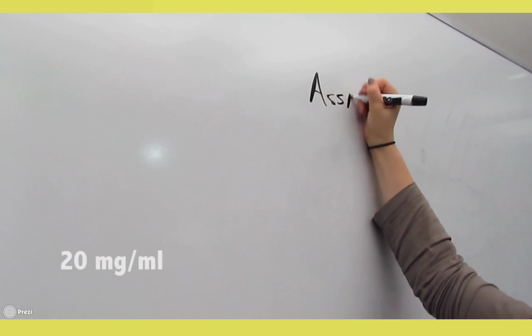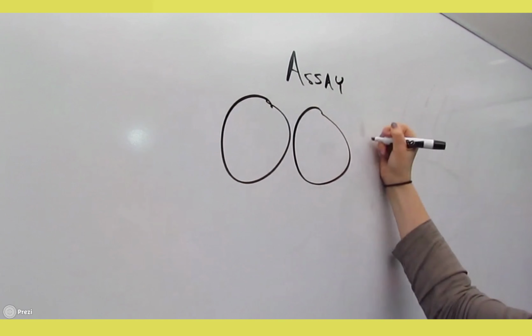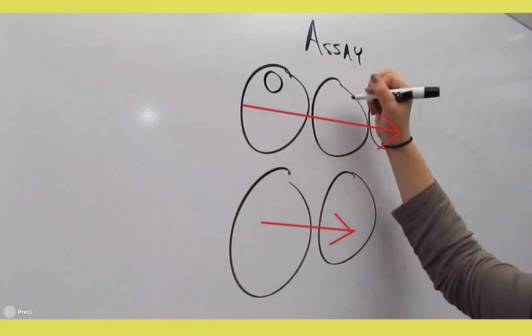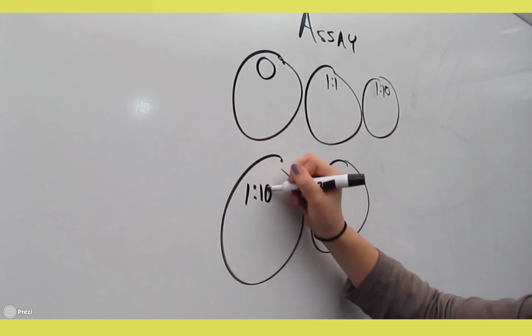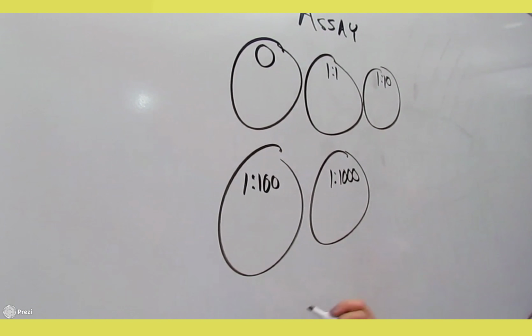As chemistry mentioned, the concentration of the solution is 20 milligrams per milliliter. Due to the different concentrations and levels of dilution in each sample, our hypothesis is that the toxicity of the solution would decrease according to the amount of dilution. This would mean that the 1-to-1 solution would have the lowest percentage of shrimp alive, and 1-to-1,000 would have the largest percent of shrimp alive.